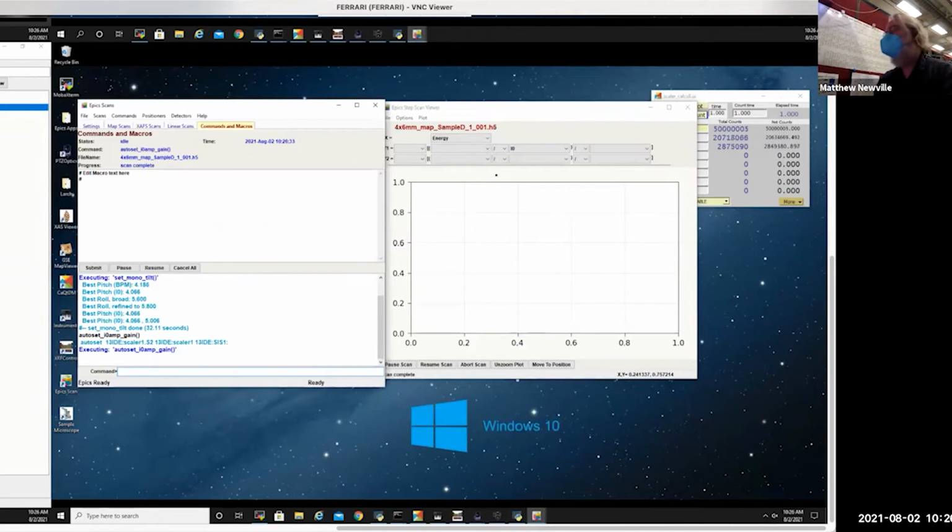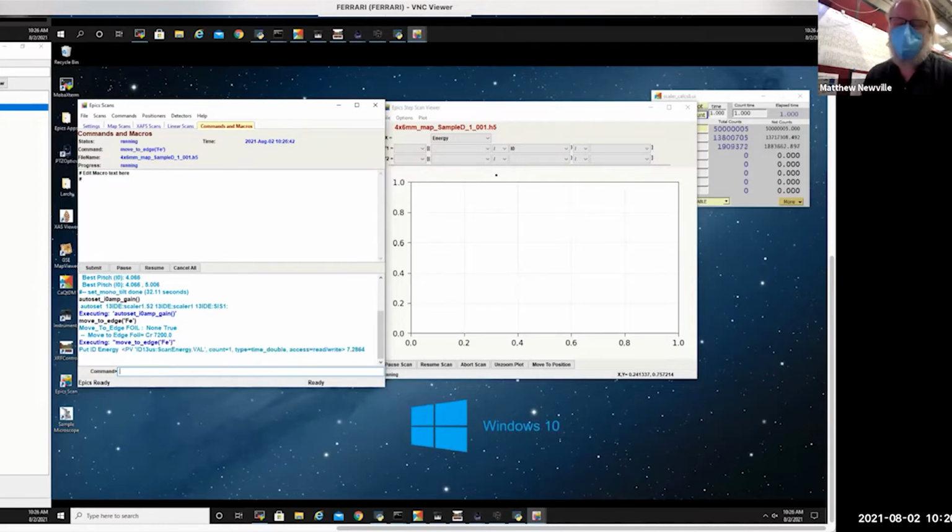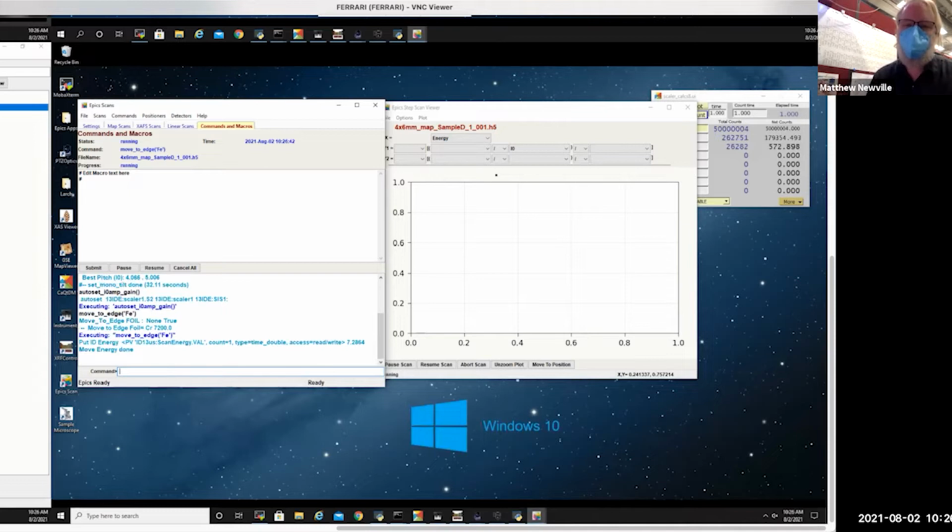So right now, I'm just going to say move to edge iron. So this will move a lot of things in the beamline, right? At this beamline, we're using an undulator. There's a monochromator, silicon 111, and then we have mirrors to deflect the beam, and then a small source in between the monochromator and the end station. We have a small slit that we redefine the beam in the horizontal, a secondary source aperture, and that allows us to do a better job of focusing the horizontal. I don't want to belabor that point too much.